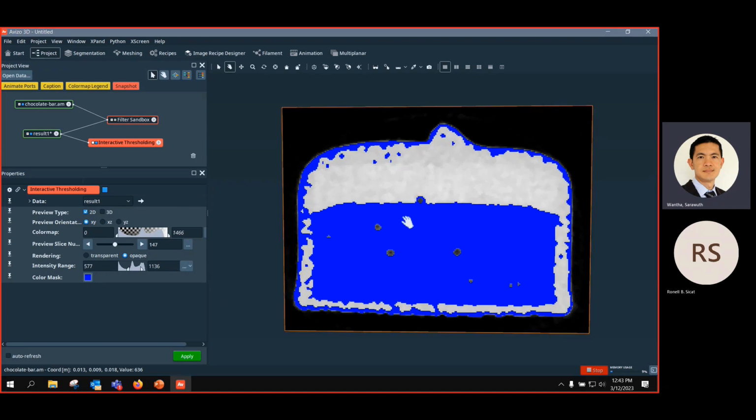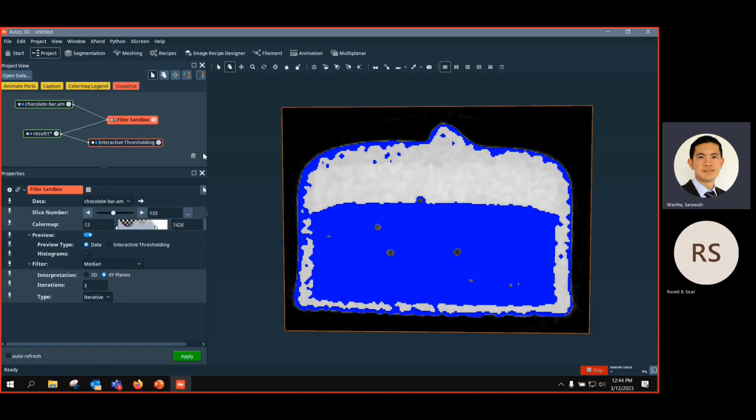So we're going to do segmentation right now. The first step of image segmentation is to binarize or threshold. And before thresholding, it's always good to apply a filter to smooth, remove the artifact noise and correct the background.